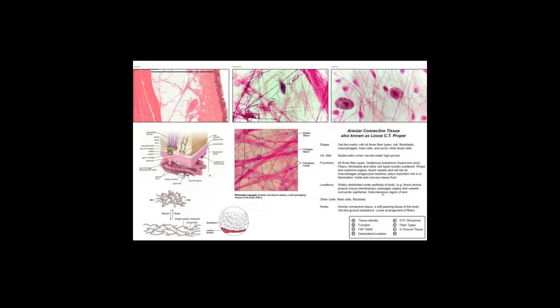Okay. Underneath those epithelial linings, here we have what we were just looking at. This is a great view right here of the skin that covers the surface of the body. And you can see keratinization here and the dead cells sloughing off. This looks like, and I'm not sure where it was taken from, but because of the layers here, it's been cut from superficial to deep through the layers of the keratinized stratified epithelia. Keratinized being dead layers, so the surface of the body.